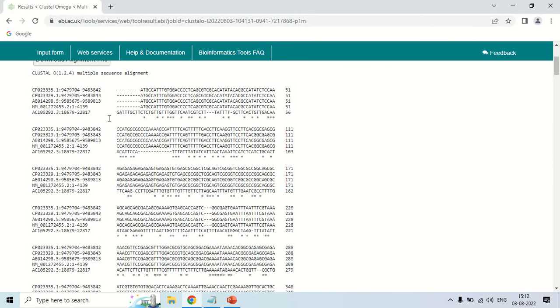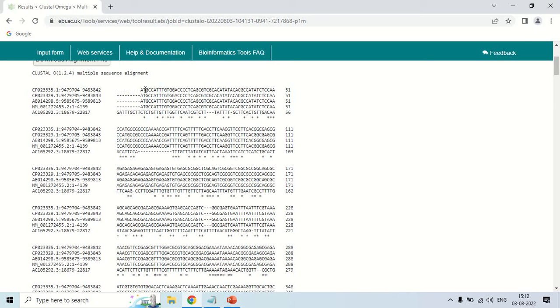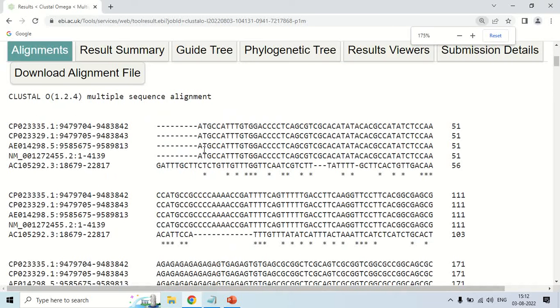I have taken five sequences — one, two, three, four, and five. These are the accession numbers of the sequences which you have taken. These are the nucleotide sequences: this is the first sequence, this is the second, and they are now aligned. I am zooming in so it is more clearly visible. These dashes represent that there is no base found by the software corresponding to those positions.